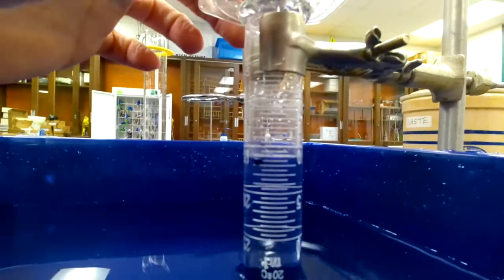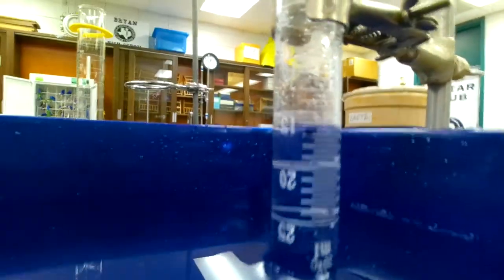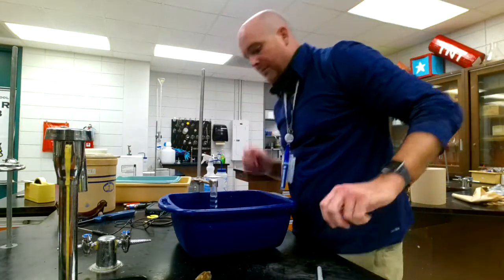So here's our volume right here. Now you can see that these graduated cylinders are actually meant for this because they are inverted right here. So that's 5 milliliters, 10 milliliters, and 15 milliliters. I wish they would have inverted the actual numbers. But that was 5, 10, 15. So that is right around 16, almost on the nose. So I'd say about 16.1. It's probably your best estimation. 16.1. Again, we're not looking at the uncertainty here. Success, guys.